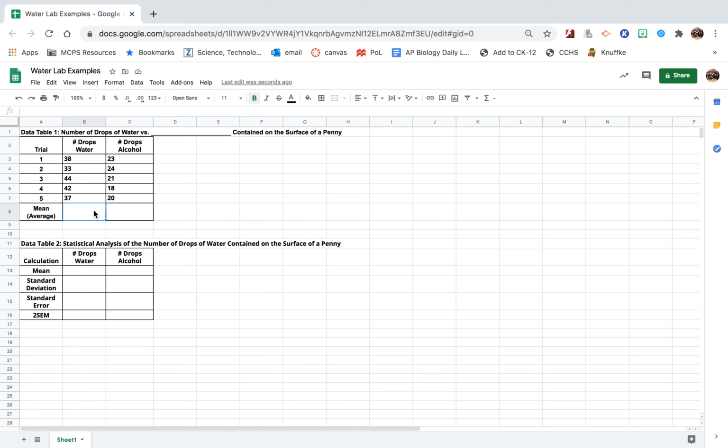And then you want to do the water one first, okay? Because if you put an oily or non-polar substance in after, it might mess up your pipette, okay? And then you're done with the pipette. You can trash it or dispose of it if you're done.